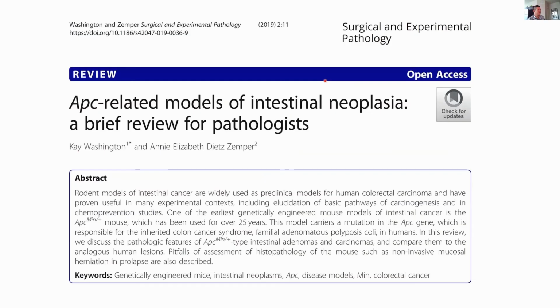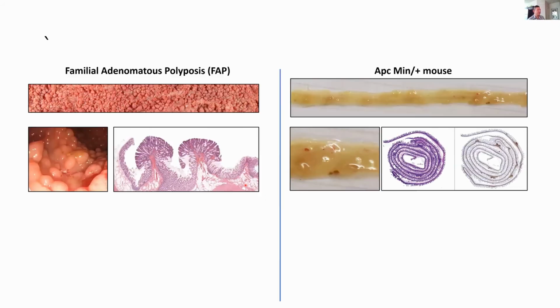So most of you are familiar with the mouse model, but there's a recent paper by one of our colleagues, Kay, who does nicely summarize what some of the pathology for the APC min mouse. So again, despite this having been around for such a long time, it certainly has value for us, both as an experimental model for therapy, but also for pathology analysis of drug response as well.